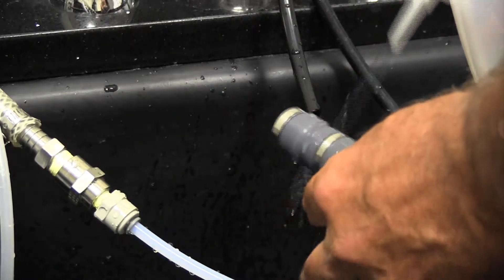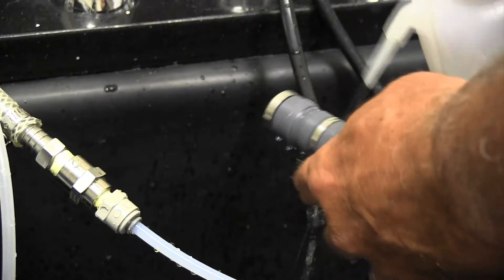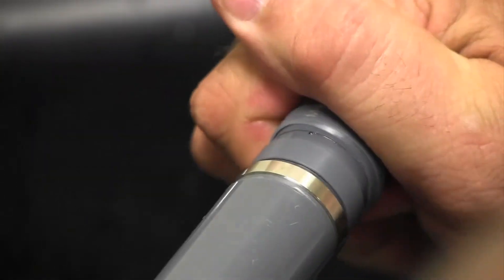Rinse off any excess electrolyte that escapes from the top of the cap and through the vent, and then dry the probe exterior. Now be certain the membrane cap has been hand tightened as far as it will go.